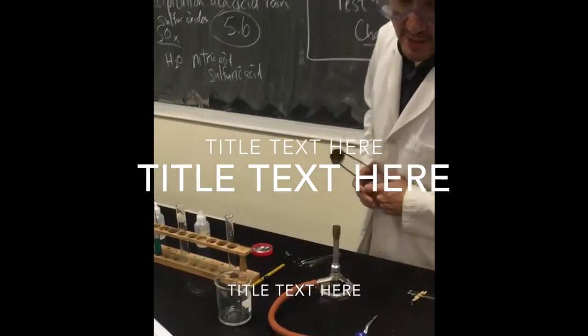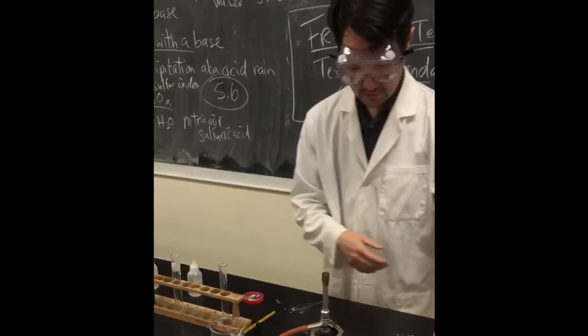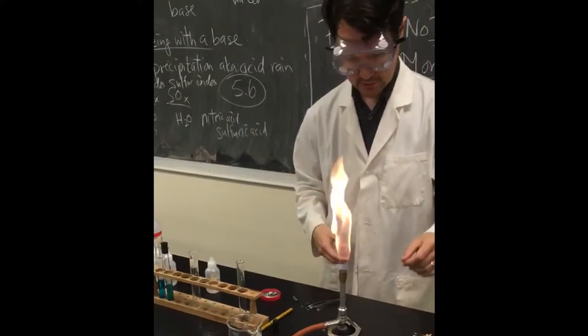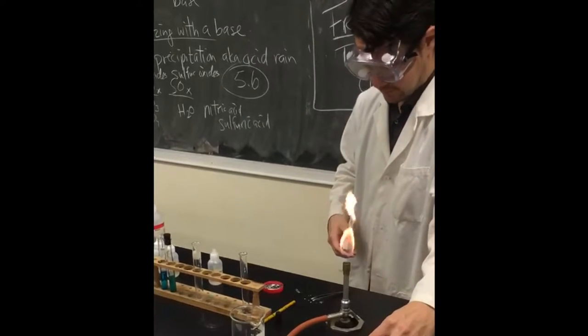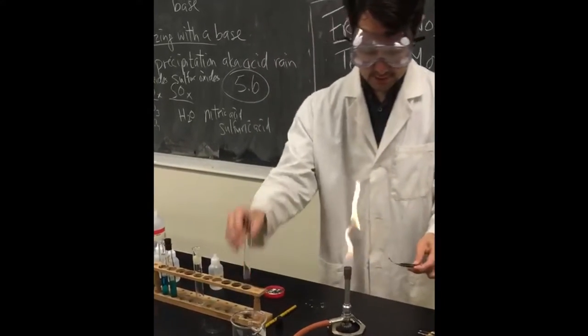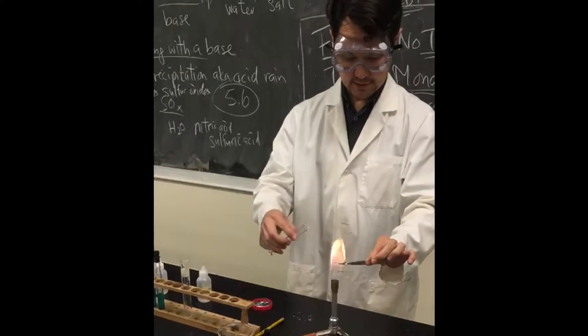Okay, so this is the chemical reactions lab. Hello. I'm just going to quickly run through the reactions that we have done. So, to start, we're going to burn some magnesium and make magnesium oxide. Put it into this test tube here.